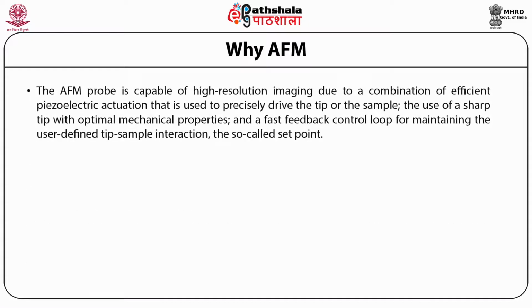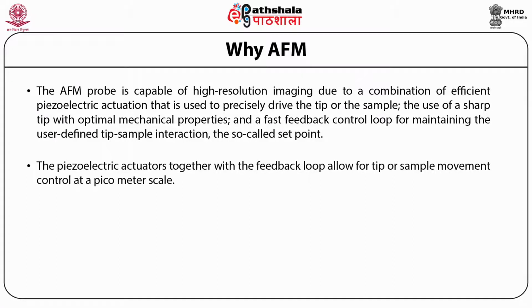The AFM probe is capable of high resolution imaging due to the combination of efficient piezoelectric actuation that is used to precisely drive the tip or the sample, the use of a sharp tip with optimal mechanical properties, and a fast feedback control loop for maintaining user-defined tip-sample interaction, that is called set point. The piezoelectric actuator together with the feedback loops allows for the tip or sample movement control at the picometer scale.